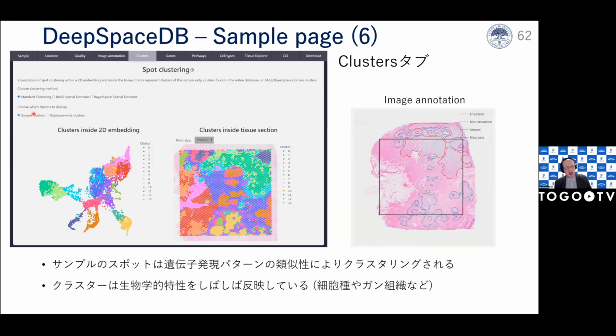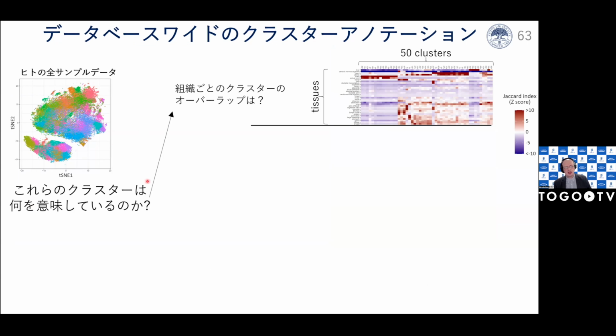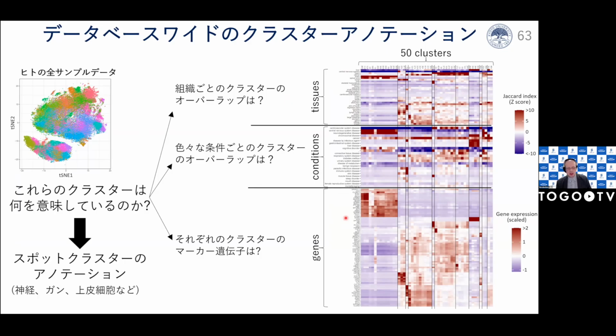In addition to that, we also took all the spots of all the samples and clustered them. Now these are millions of spots. And then I tried to give an annotation to each cluster. So for example, we checked for every cluster how much it overlaps with every tissue, or how much it overlaps with each condition, or which marker genes are expressed in every cluster. And then based on these, we try to give a global annotation to each of these clusters. Maybe they are neurons or they are tumor and so on.